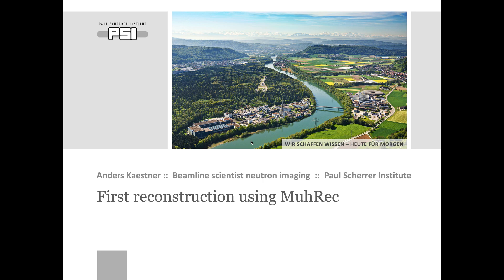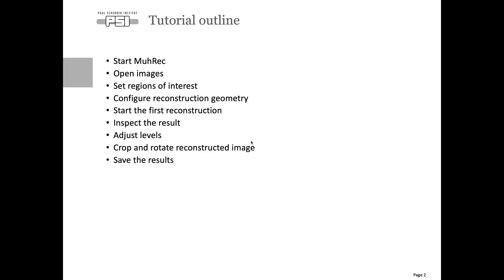I'm going to show you how to do your first reconstruction using MuhRec. The tutorial outline is that first we start MuhRec, then we open the projection data.